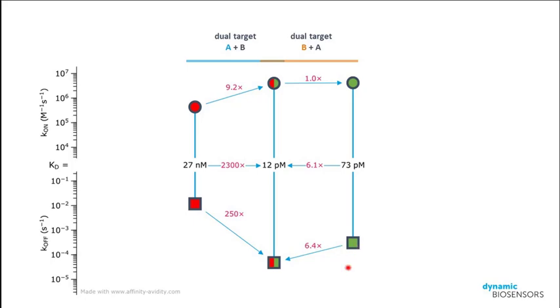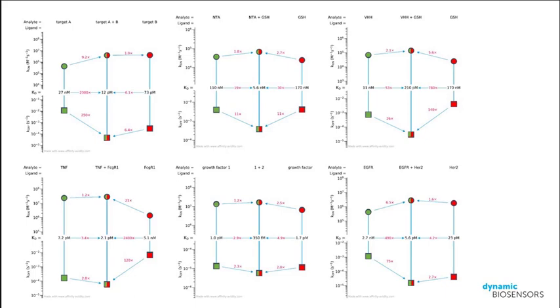If we repeat the same experiment with different analytes, bispecific IgGs as well as similar bispecific binders, the result is always different. The effect of cooperative binding depends on the association and dissociation rates of the single binding domains, on the linker length, on steric factors, and on many other parameters. This means that all parameters, affinity and avidity binding, need to be measured every time to allow us to draw a complete picture of the systems that we are working with.